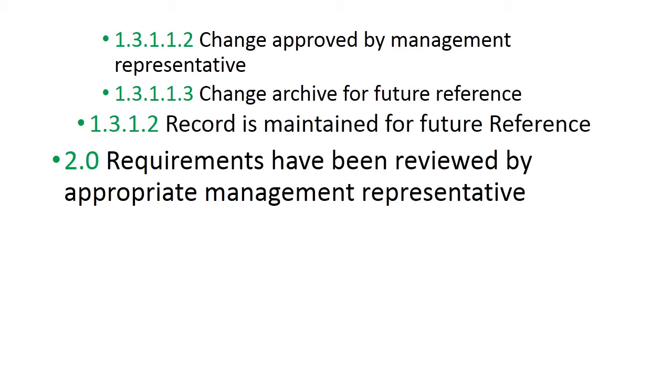So whenever there is an audit from an external agency, we are supposed to produce this kind of documents that we made certain changes in approved standard operating procedures. Requirements have been reviewed by appropriate management representatives.